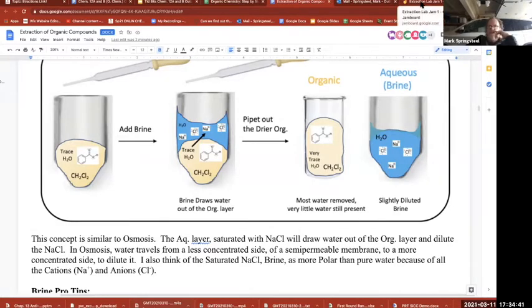You could, but in this case, I would actually not sacrifice it. The reason why is, let's say I grab a little bit and I pull a little water into this. This will have a little more water and it'll grab some sodium and chloride. I'm not so worried about it because I'm going to do another drying later with sodium sulfate. I'm going to do a final dry.